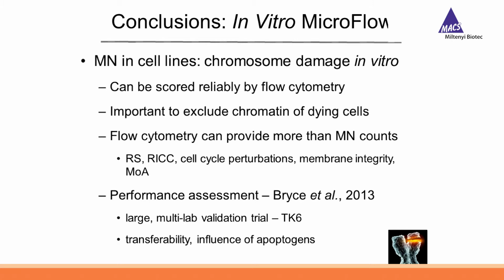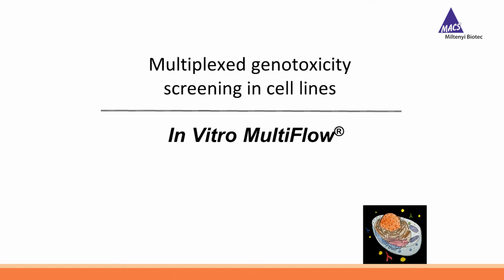And you can see excellent transferability, information on influence of apoptogens, as well as numerous other aspects of executing that assay across multiple different laboratories. That's in our citation from Bryce et al. in 2013. If you're interested in any of these papers, you should be able to find them quite readily online. Otherwise, you can request them from me.